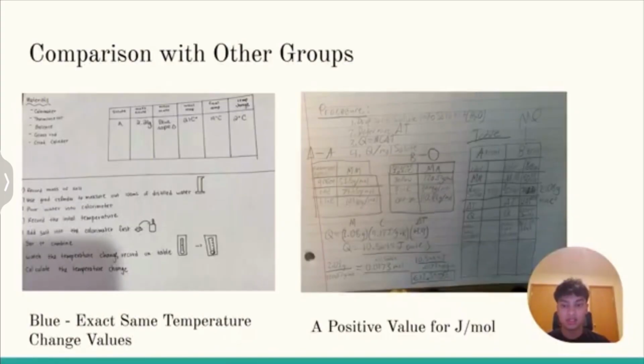There could also be some human error in the measurement of the milliliters and the grams of solute added. So all this would change the effectiveness and the accuracy of the experiment. So later on in another experiment to improve this, we could make sure all the solute dissolves and that we put the lid on quickly and that we recheck our measurements.